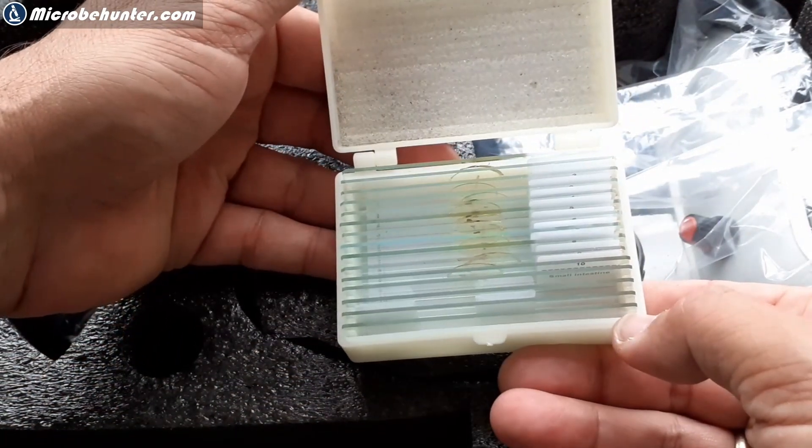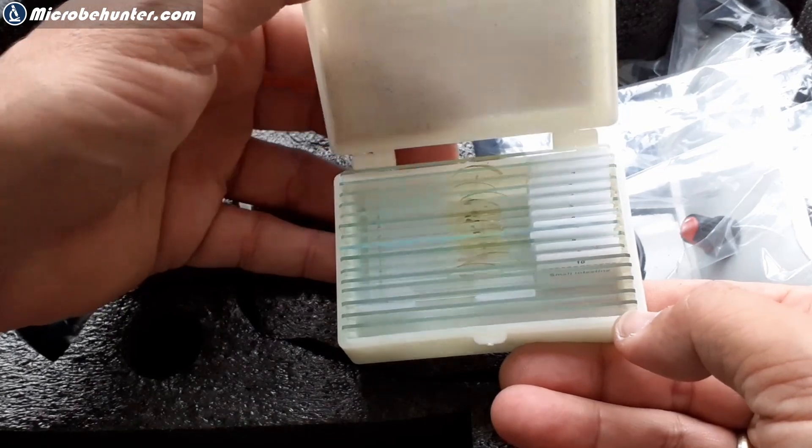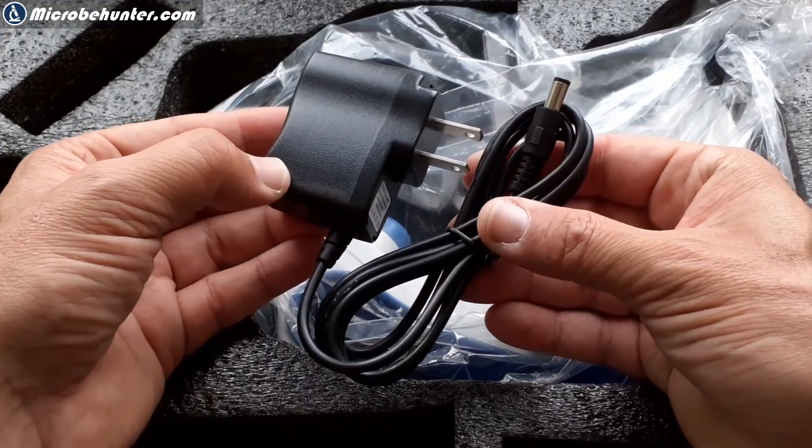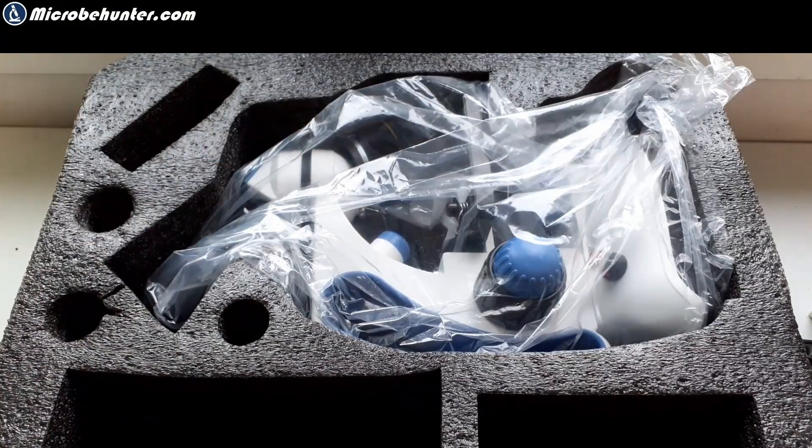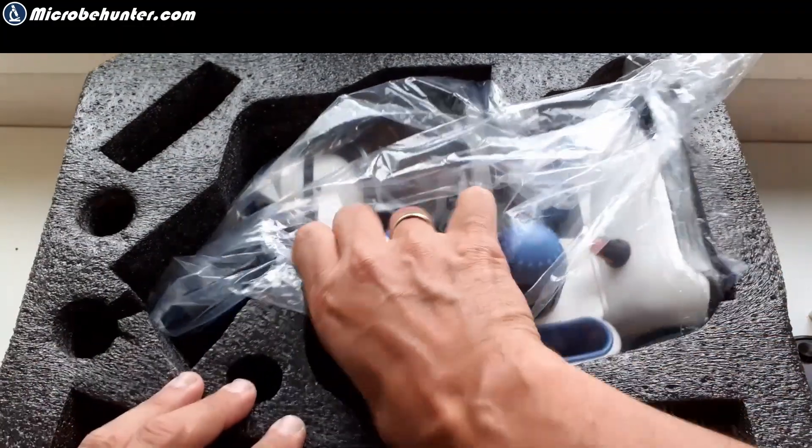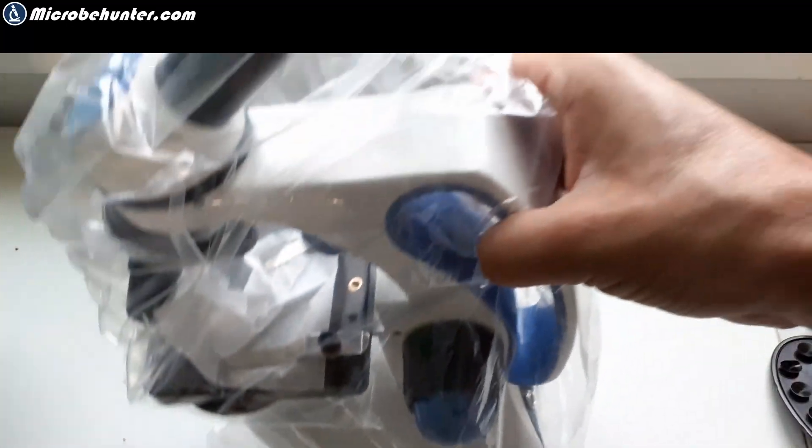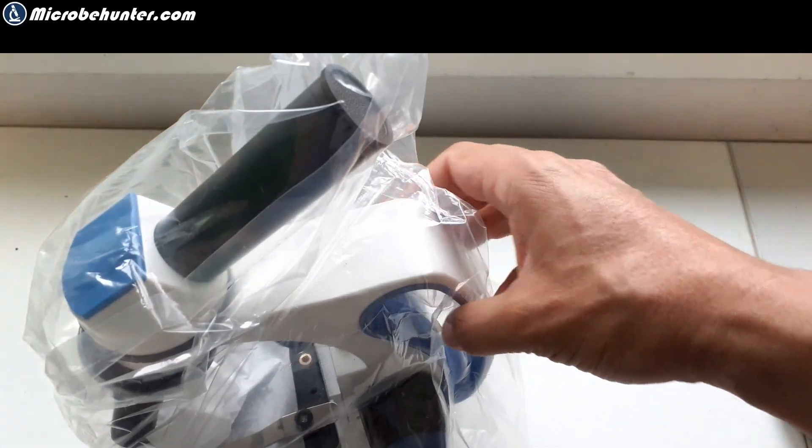There's a set of slides, prepared slides. They're quite nice and there's also a description about them in the manual. There is a power adapter, but the microscope can also be powered by battery and this makes it very portable. So let's take it out. Let's have a closer look now at what we get here.